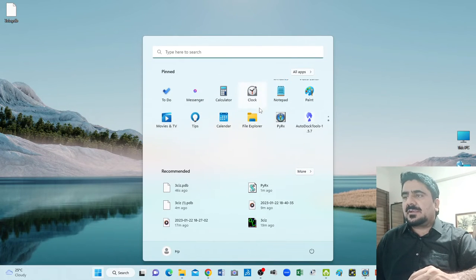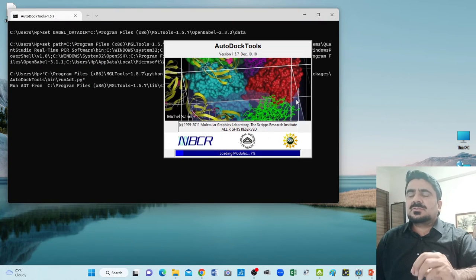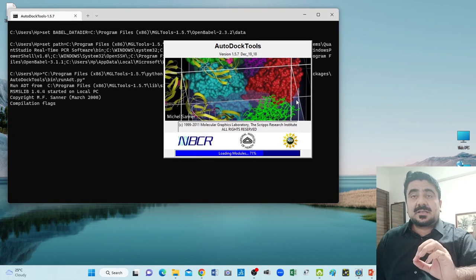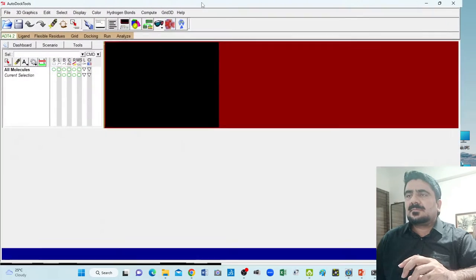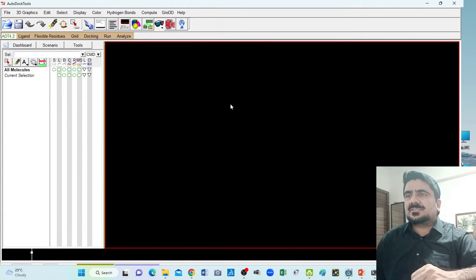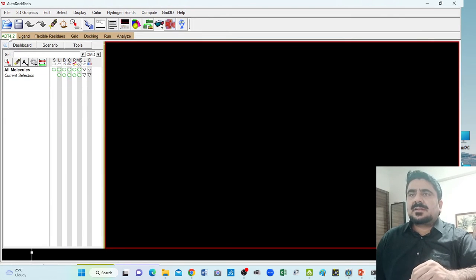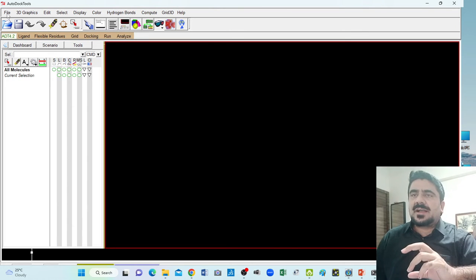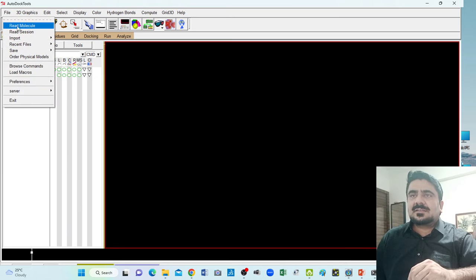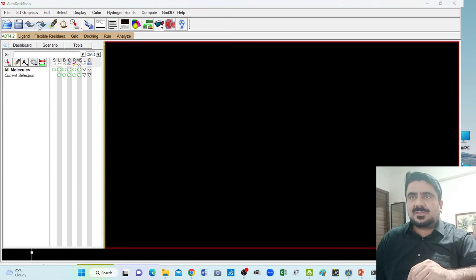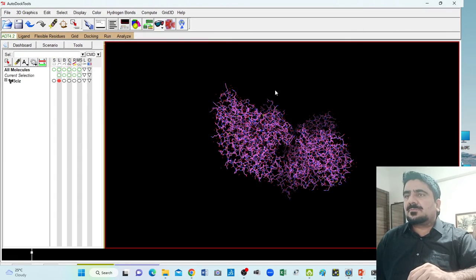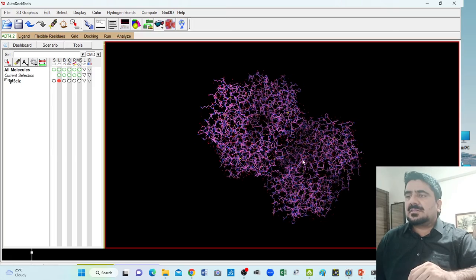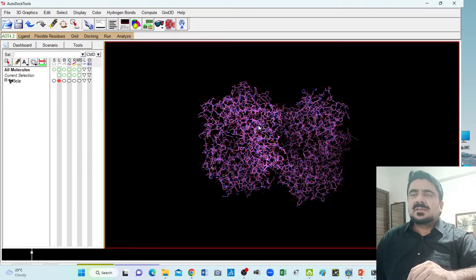Now we will open another software called AutoDock Tools. AutoDock Tools is used to change the PDB file of a specific protein into PDBQT. This is also free software, and you can do protein docking with it — in next lectures I will make videos on protein docking. But now we are just using this software to change the PDB file into a PDBQT file. Go to File, Read Molecule, click Read Molecule, move to the desktop. Here is our PDB file 3CIZ — click Select and Open. It will pop up on the AutoDock Tools window.